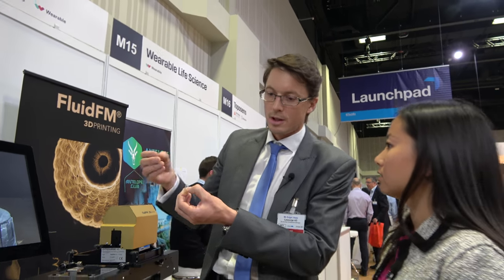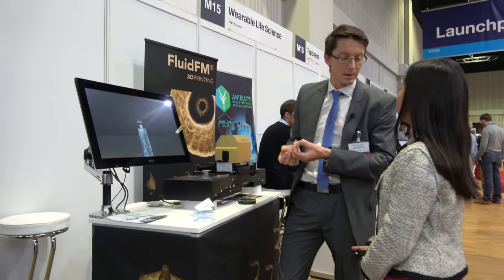And these femtoliters we control. With these femtoliters we are able to print the metal objects out of the metal ions.